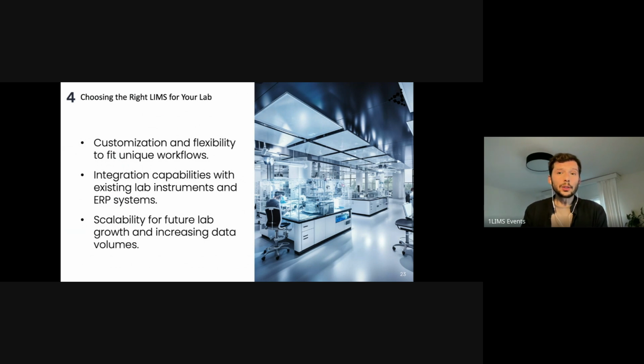A LIMS solution. So not all LIMS are created equal. The key is to find the one that works for your specific industry and for your workflows.